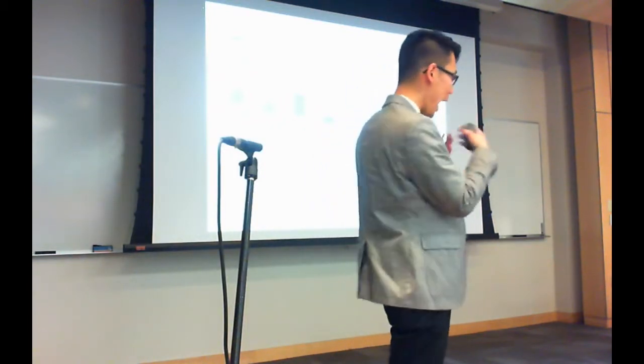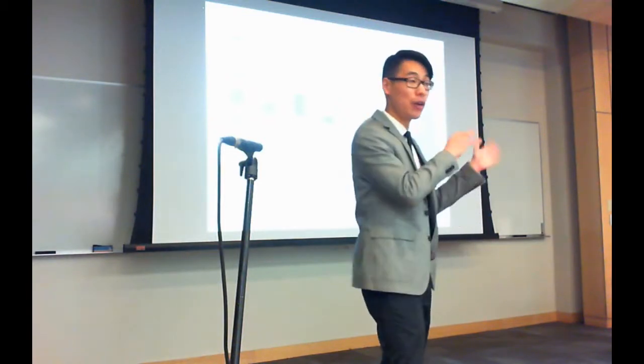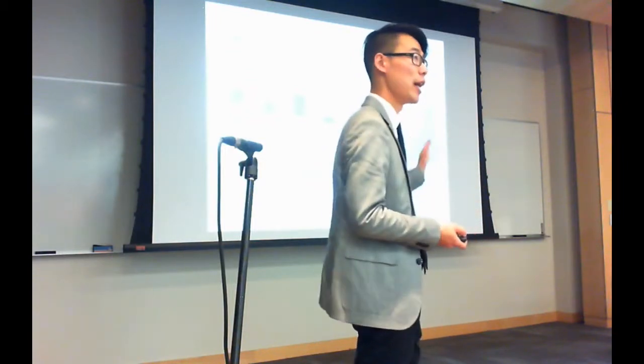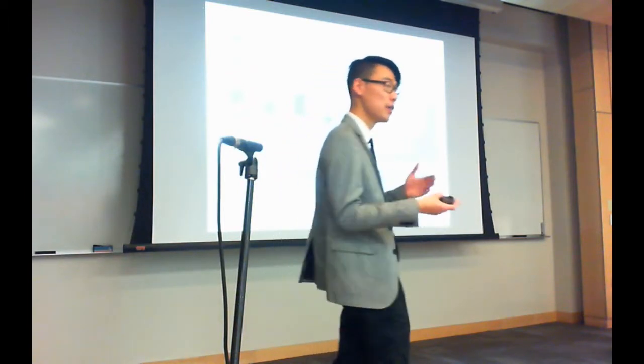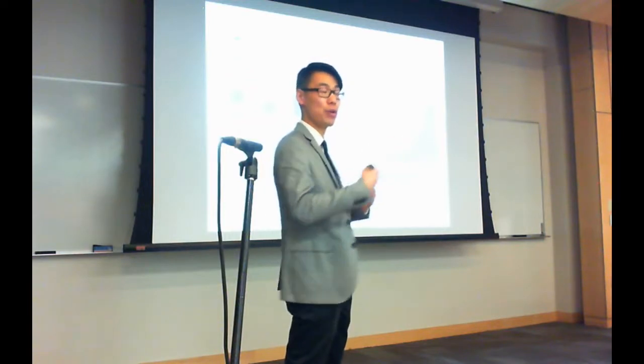And we can see here the score distribution between the items in our library and the synthetic data, how similar the spectra are. And it's very tight at a very high cosine, so that gives us a lot of confidence. These 700 proteins that we're calling are likely to be correct. About 70% of them were actually validated. The rest were not validated because they did not synthesize the correct peptides that we're actually observing in the data.